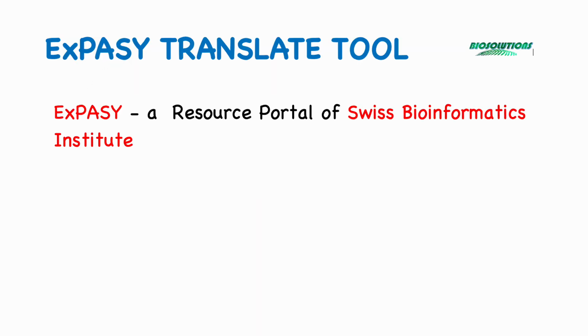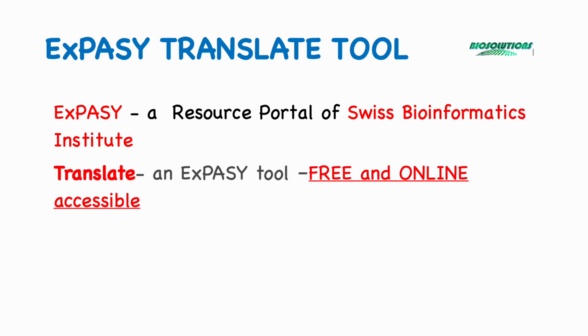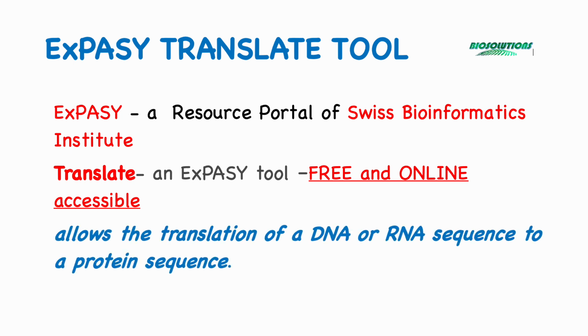Let's begin with ExPASY, which is a resource portal of the Swiss Institute of Bioinformatics. This portal and its tools are free and easily accessible online. Translate is one of the tools which allows the translation of a DNA or RNA sequence to a protein sequence, which is made up of amino acids.